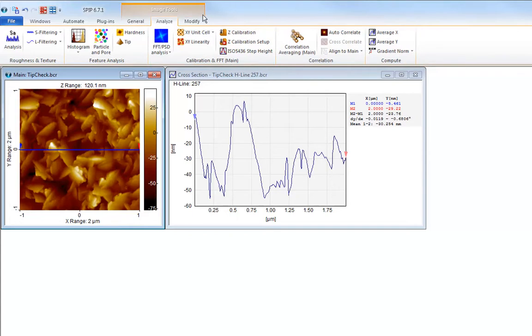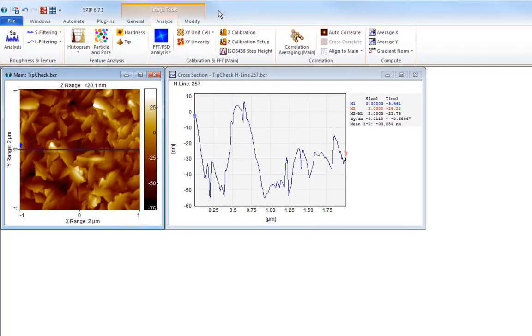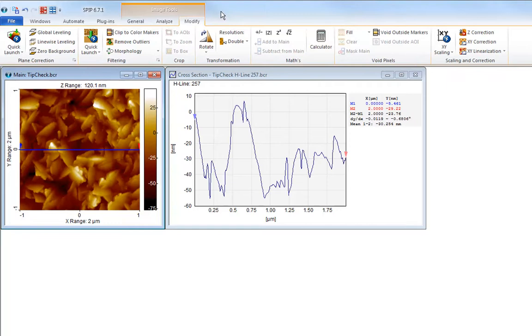On the analyze tab we have access to analysis functions such as roughness analysis, particle analysis and so on. On the modify tab we have tools for manipulating the data, for example plane correction and filtering.